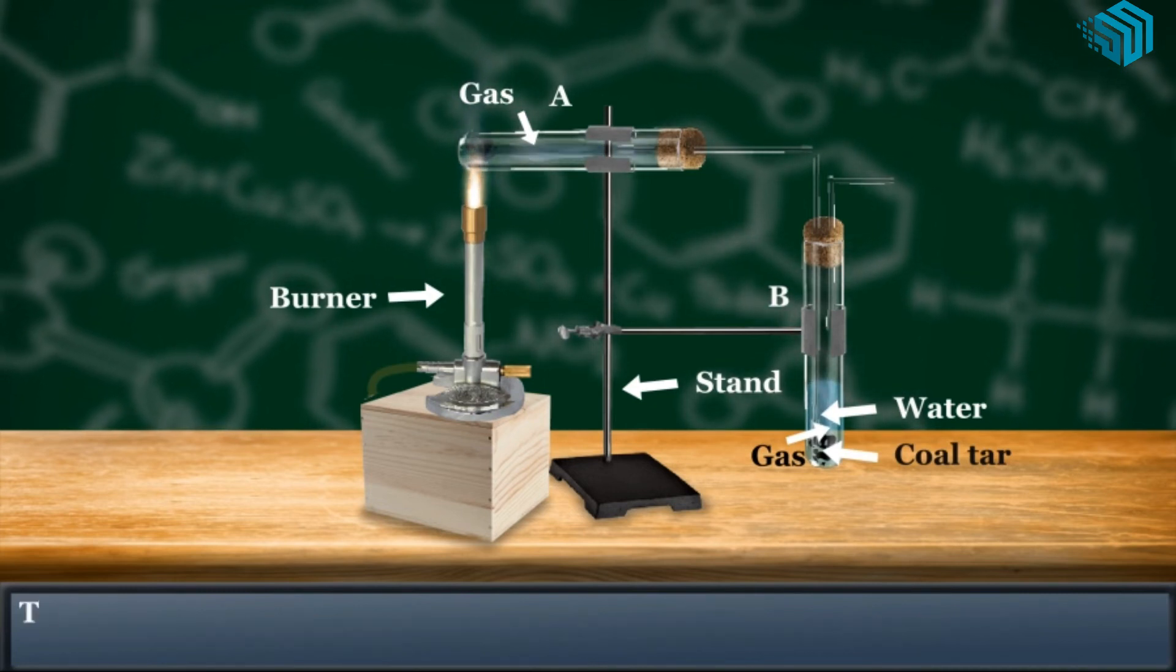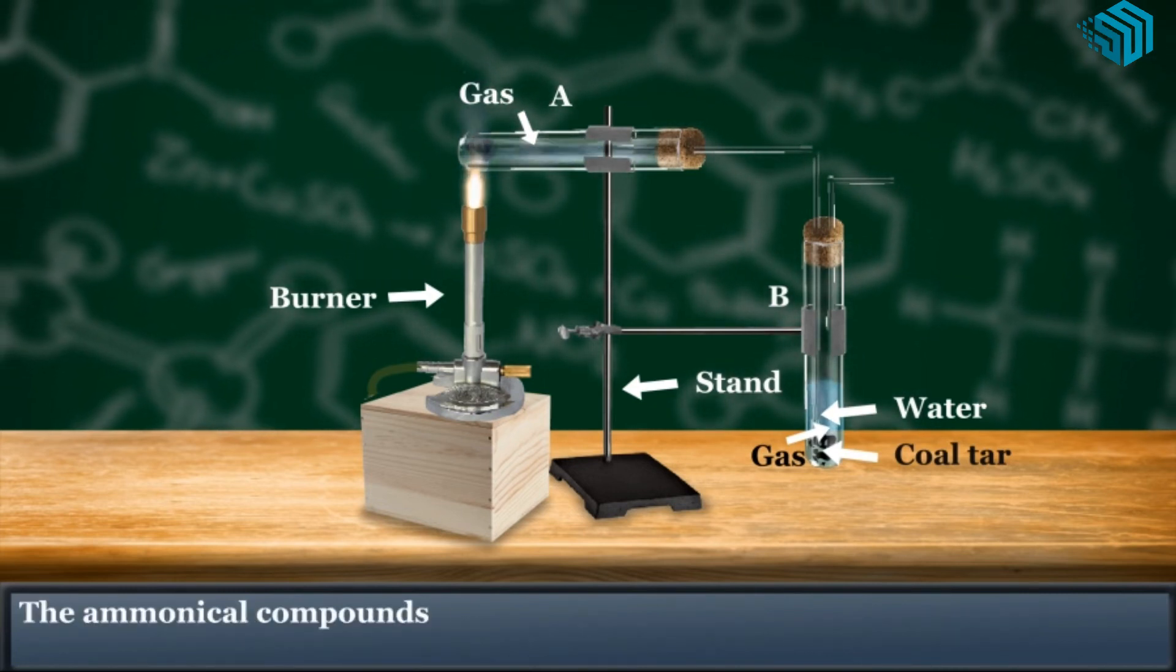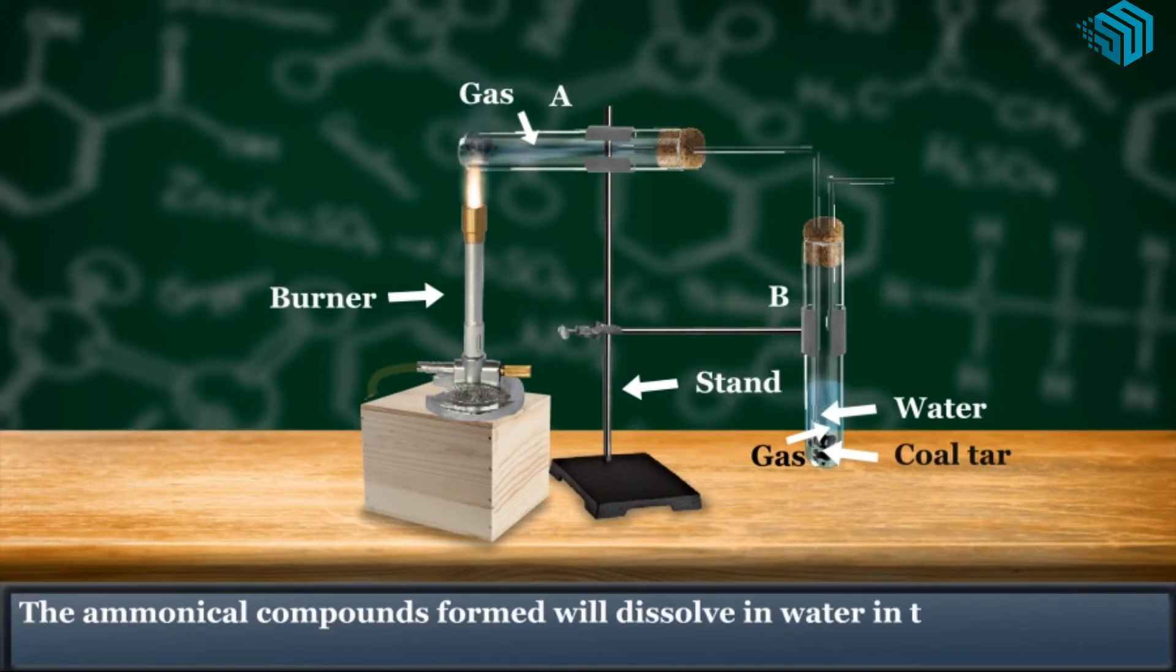The ammonical compounds formed will dissolve in water in test tube B to form ammonical liquor.